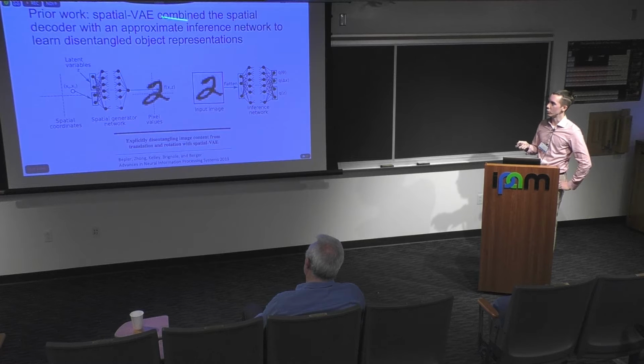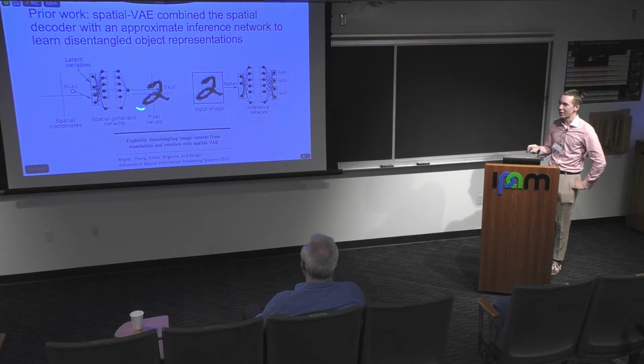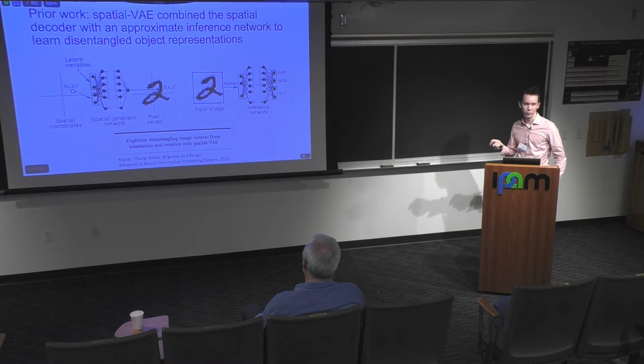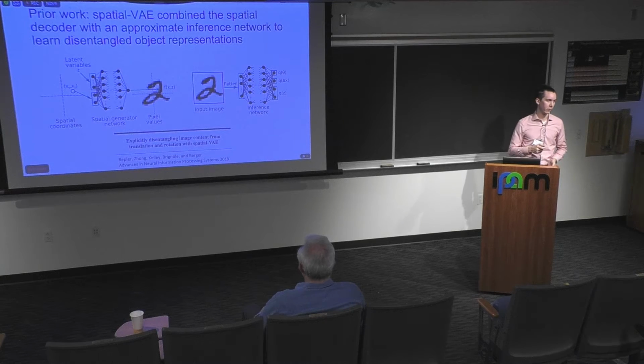But what we're doing here is using an encoder that doesn't have the good properties that our decoder has. Our decoder here has these wonderful equivariance properties to coordinate transformations, but our encoder, sorry, I was pointing at the decoder, but I should have been pointing at the encoder, is actually just some fully connected neural network that takes this image as input and outputs the parameters of our approximate posteriors.